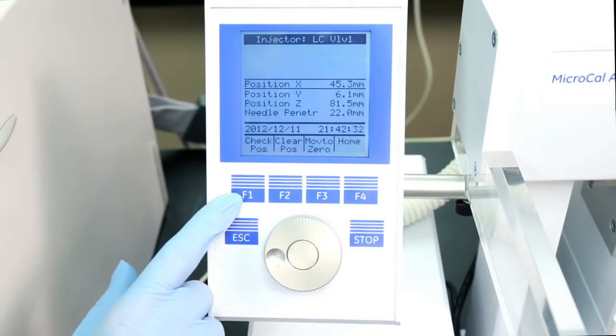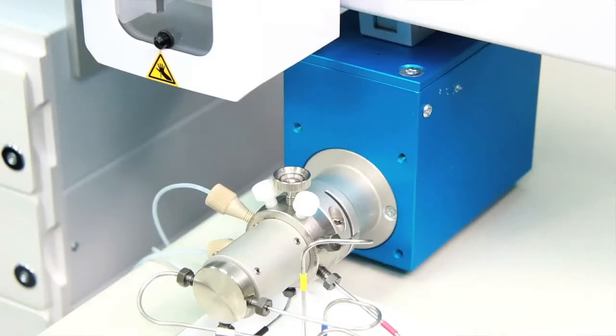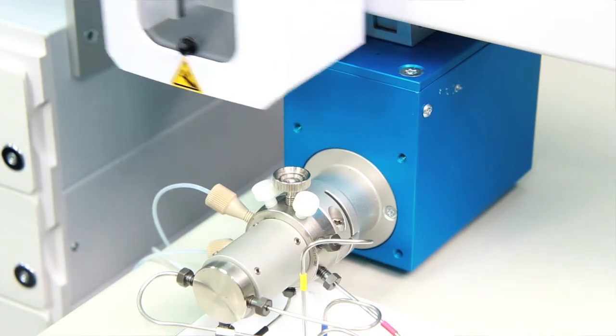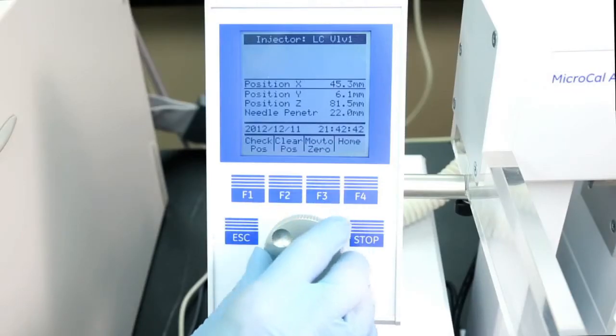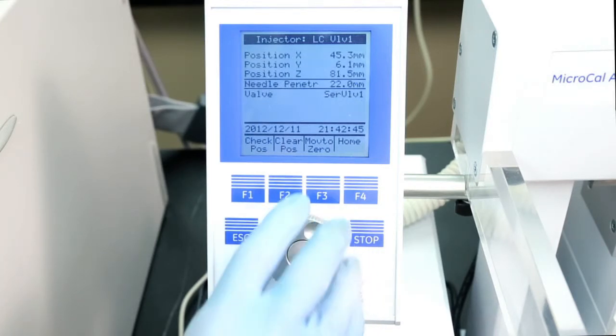Then press the F1 button to check position, and the injector unit moves to the previously defined LC valve 1 position. Highlight needle penetration and press Enter.